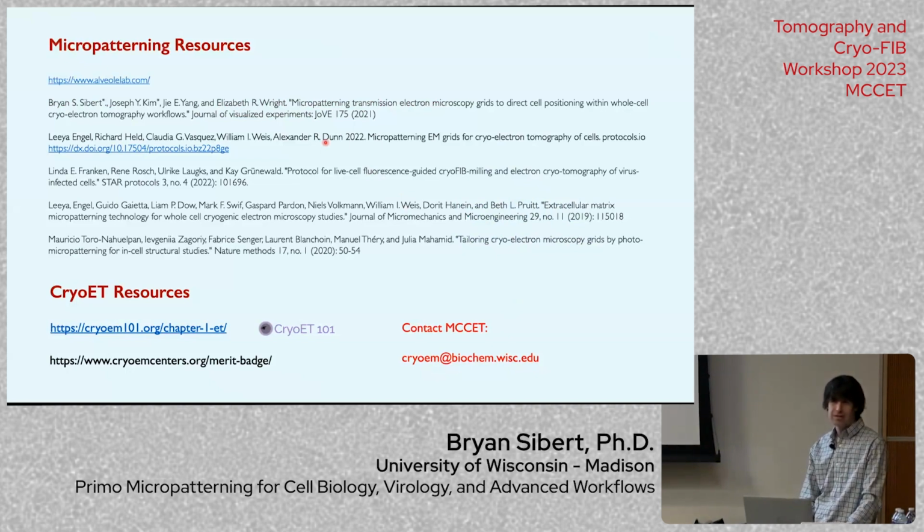Questions? Thank you for that talk. It was quite interesting. I am curious, as an alternative to micropatterning, are there alternatives for cell manipulation in general? I know of light or ultrasound or maybe even digital droplet PCR, for instance. Are there other technologies that exist, maybe not catered towards the cryo-EM audience, but ways to manipulate the cells? The reason I ask is because it seems like this requires a lot of tweaking and may be off-putting for some people to try it. I'm just curious if that's considered.